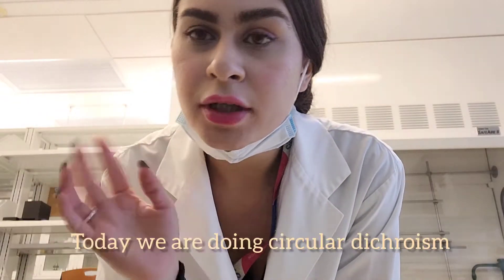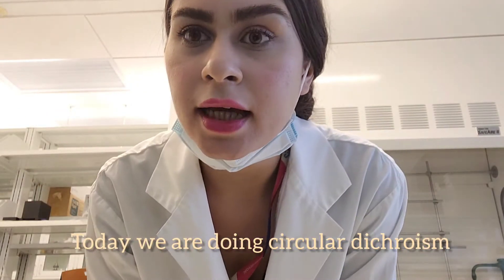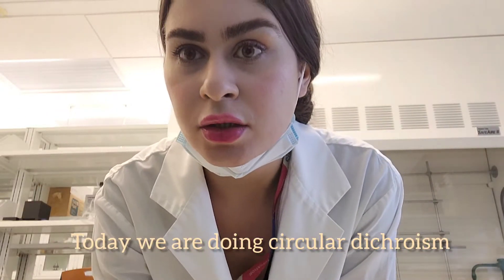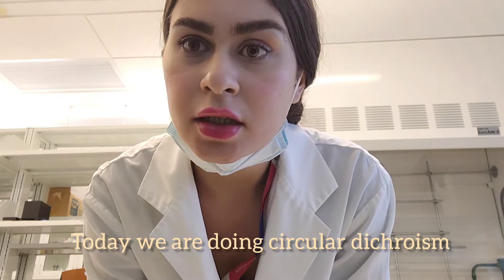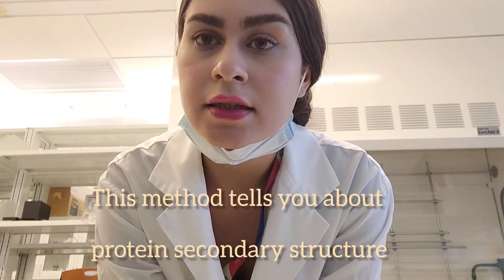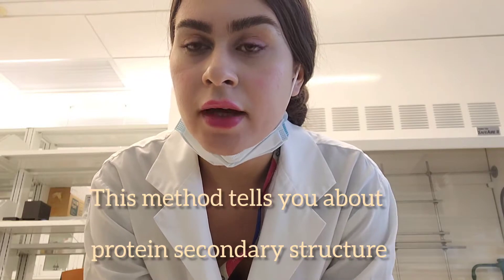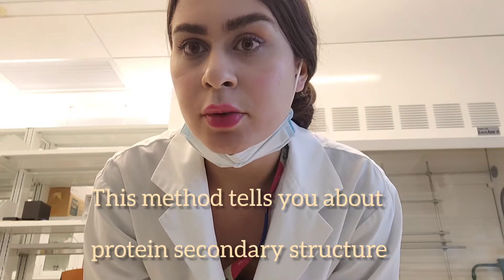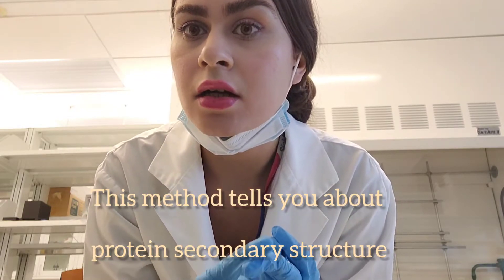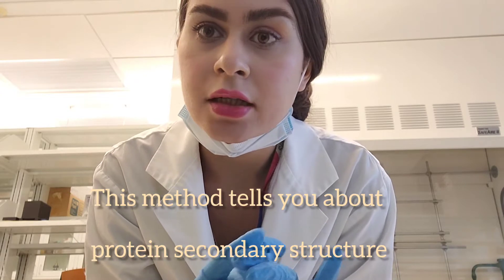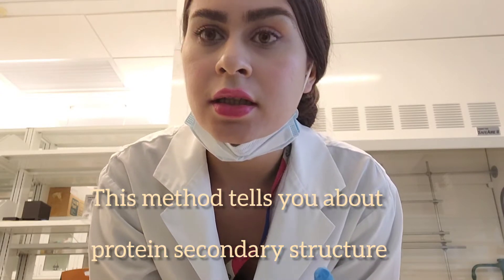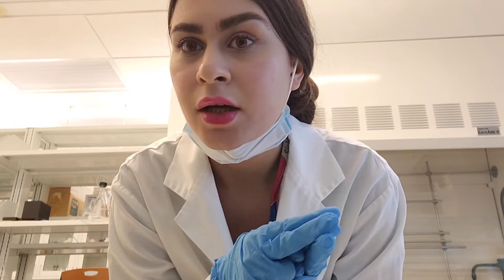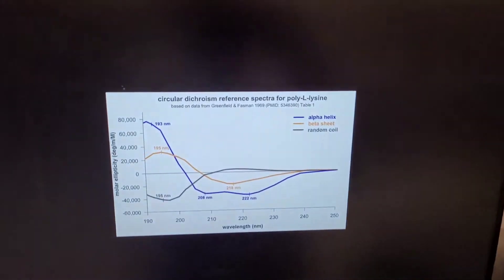Good morning. Today I want to show you how to do circular dichroism. This is a method to find out if your protein is alpha helical, beta sheet, or disordered. It's very useful and I hope you enjoy this tutorial.